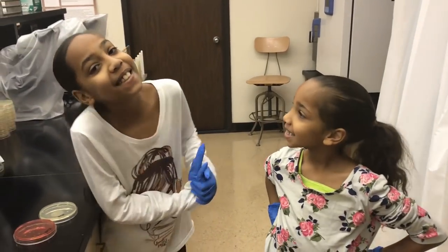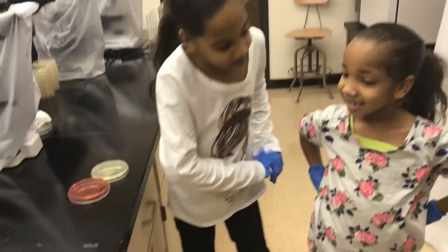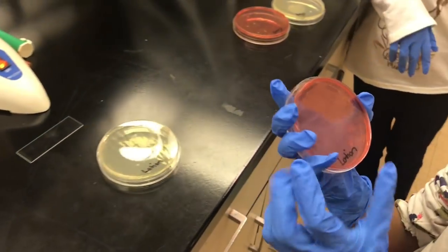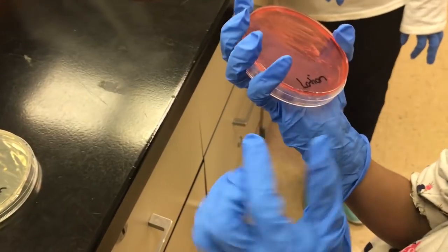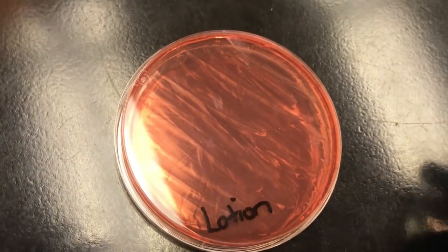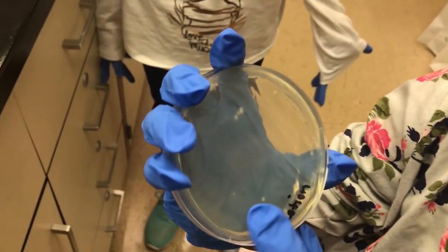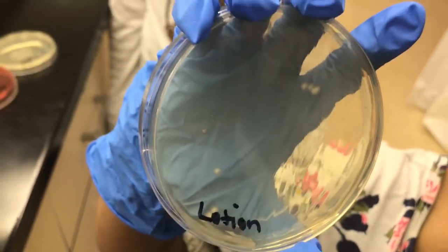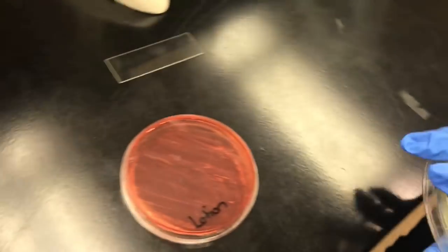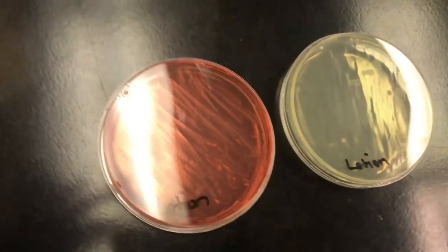Okay, so now we're gonna check the results. So Naya, why don't you show them theirs first? This doesn't really have Staph bacteria on it, on the lotion. But this one has bacteria on it. Yeah, there's some bacteria, not a lot. I guess lotion has some stuff to prevent bacteria from growing.